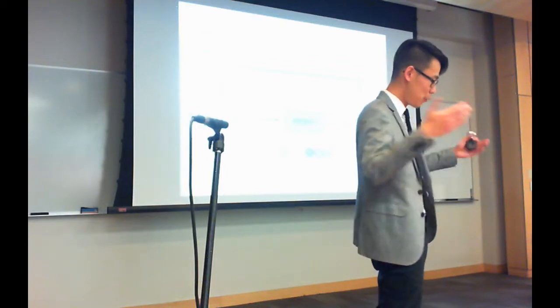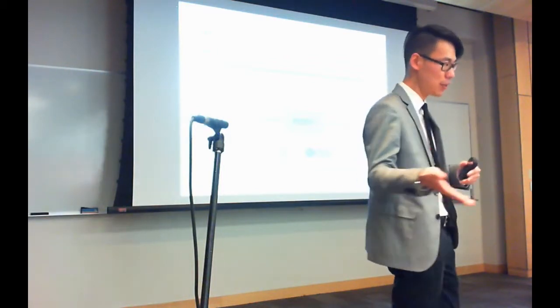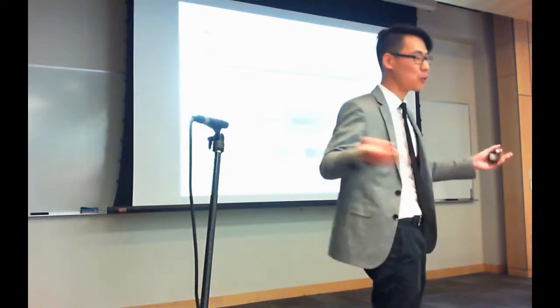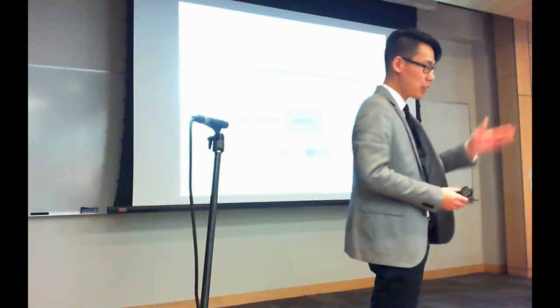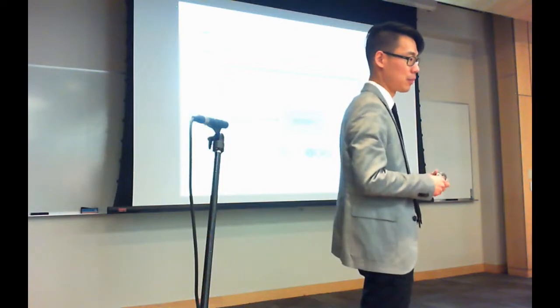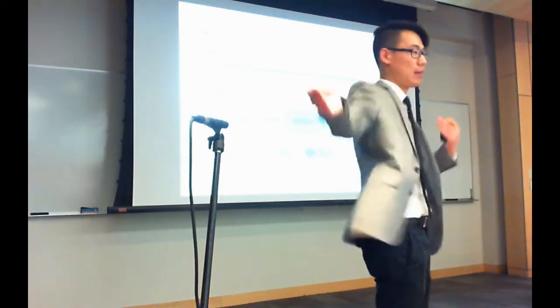But if you have it at the PSM level and then you aggregate at the precursor peptide level, all the true identifications will line up. All the false ones won't. They'll splay out. And so you're going to end up with high error rates, or an unknown error rate. And you need to start controlling that. So you can set some bar, but that bar won't be appropriate at all scales.